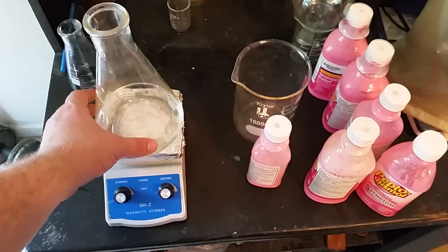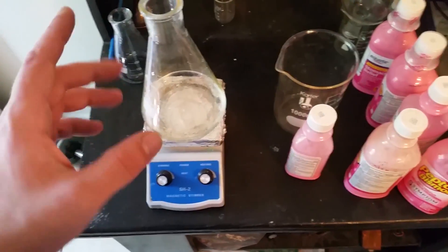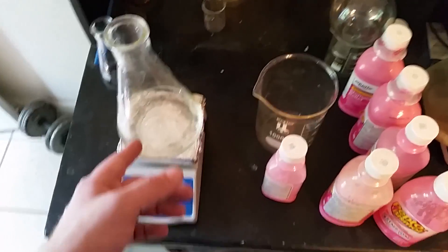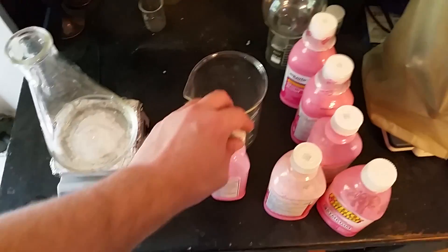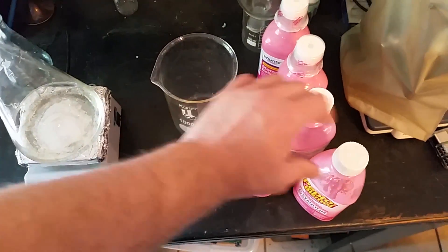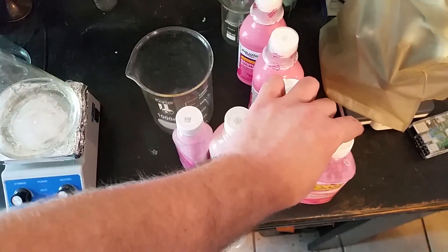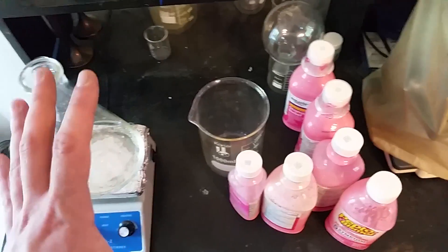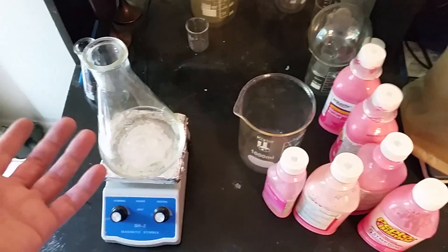In this Erlenmeyer flask we have about 200 milliliters of water. I'll be adding about another 250 or so milliliters of hydrochloric acid, and that is to dissolve the bismuth from the Pepto-Bismol. I've got a few empty-ish jugs here of Pepto and a couple new ones, so we should have plenty to get plenty of bismuth metal.